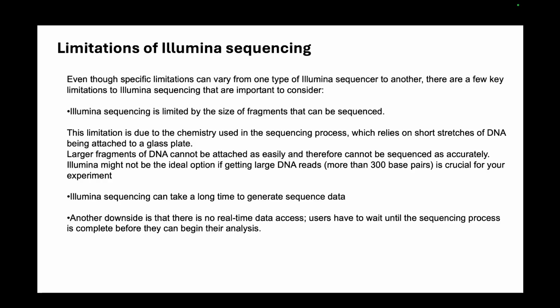So for those big variations, which we call structural variations, anything more than 50 base pairs, Illumina is not the ideal technology to use. There you use more recent technologies where you have longer reads, say 1 KB or even more. We even have sequencers currently available which can give you around 1 MB of read length. Those are the ideal sequencing platforms or technologies you should use to identify those big variations.